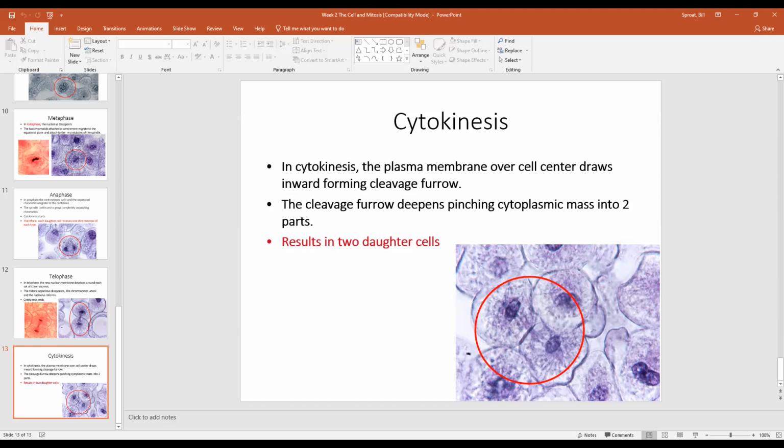They spared no expense on these toothpicks. They're the best you can get at Walmart. So you take the flat end of the toothpick, rub the inside of your cheek, and smear it on the glass.